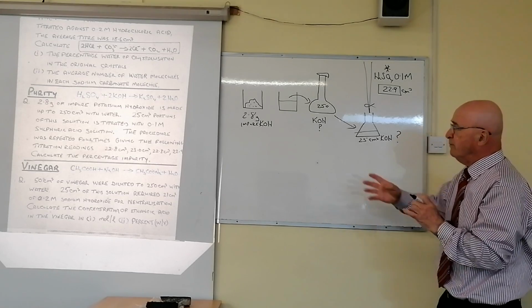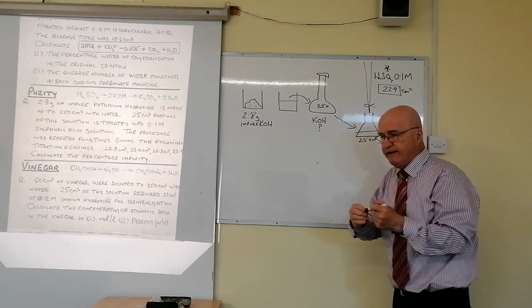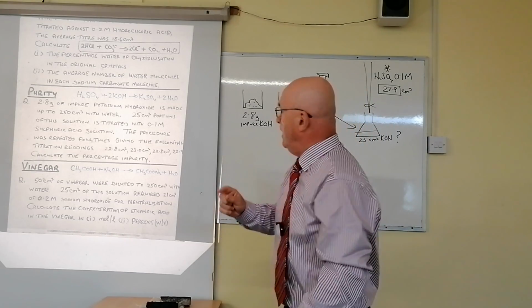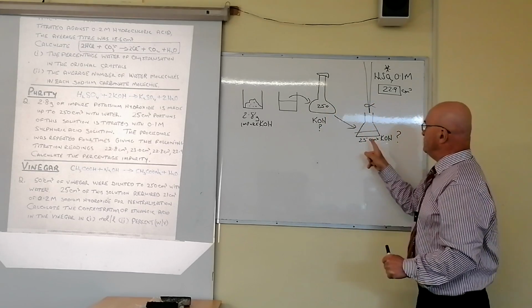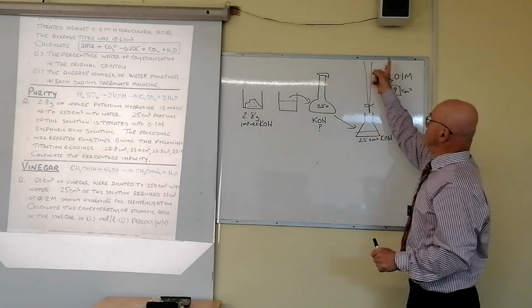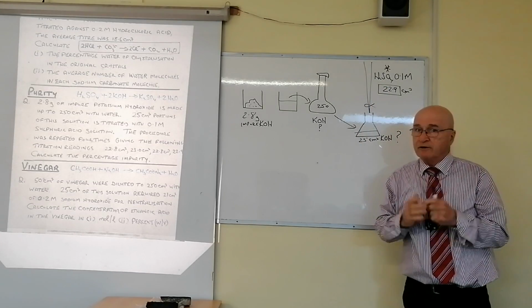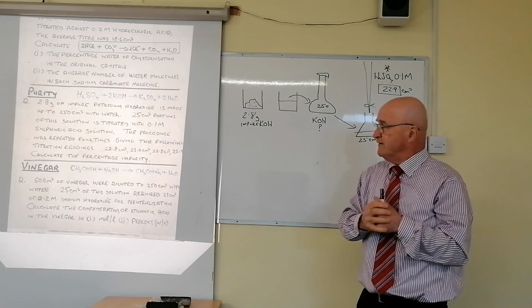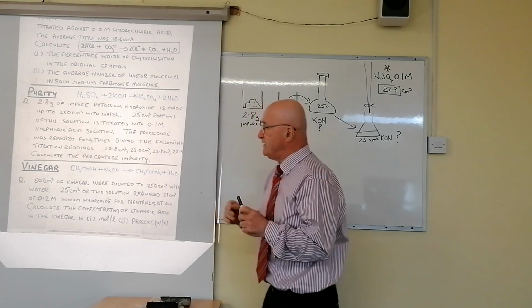I'm going to go back now for a moment before I do the calculation. It's not in that question, but I want to ask you a few things. They'll ask you one procedure for leaving cert. Either how did you prepare that solution, or how did you transfer that solution in here, or how did you prepare the burette for titration, or how did you run the titration? Now, do you remember? That's in your notes already now. They're the 4 commonly asked questions. Not in the question at all. Now, these are all about calculation. But I'm just going to mention briefly to you now.